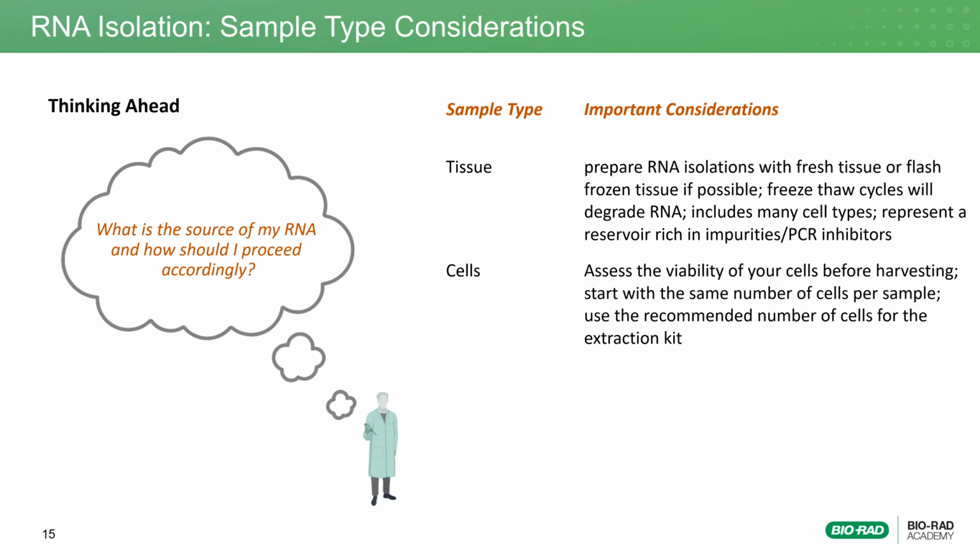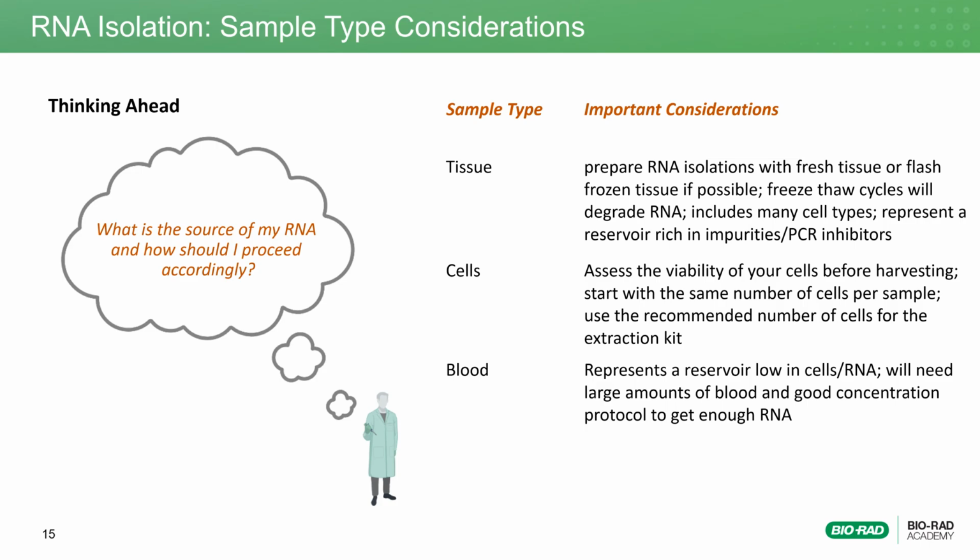As demonstrated in the previous figure, extracting RNA from blood can prove difficult due to the low numbers of cells contained in blood. You may try concentrating the cells from several pooled samples of blood first before extracting RNA.